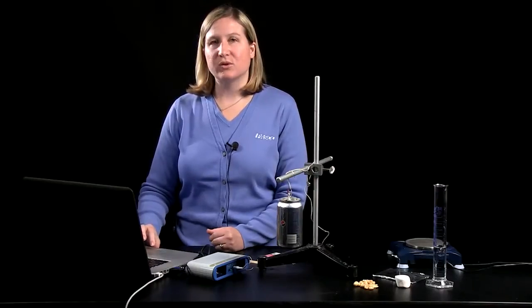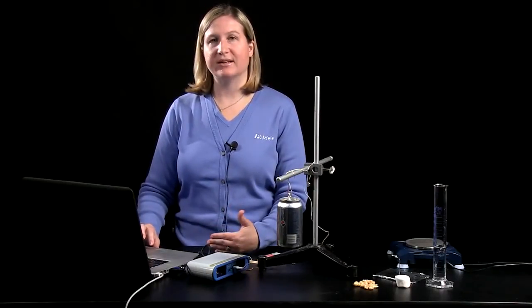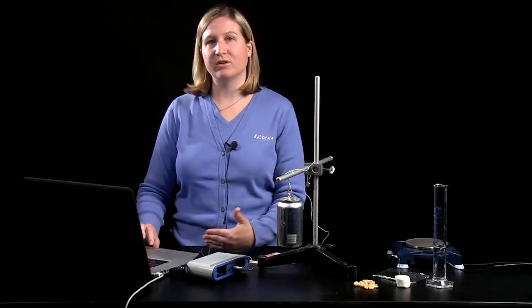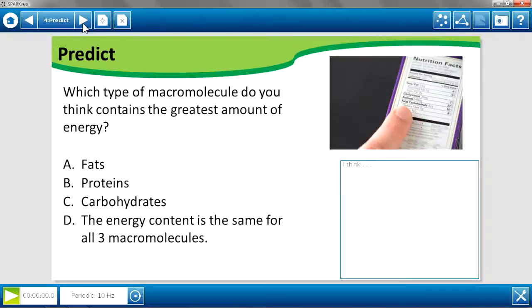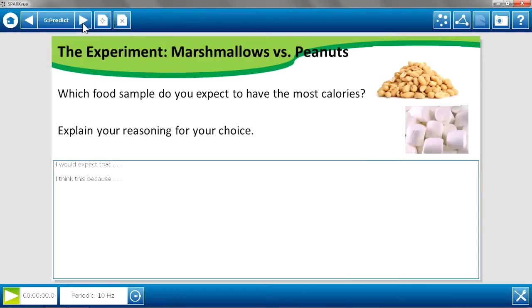It's important to connect to students the idea of calories as a unit of energy. And in this case, we're using calories as a unit of heat, seeing how much energy a food contains by calculating the heat released when that food burns.